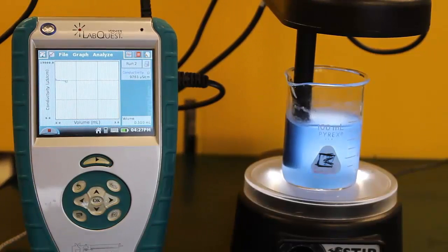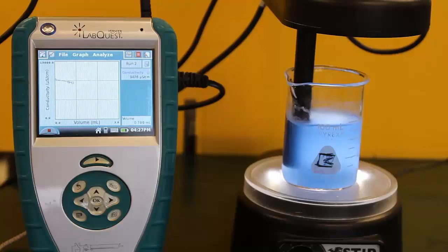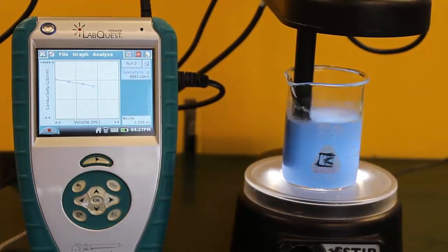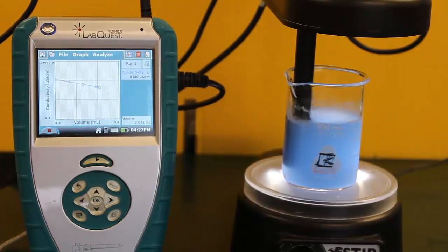The barium hydroxide solution is blue because bromthymol blue indicator has been added to it. Here we're running the video at 400 percent speed so that you can see the experiment more quickly.